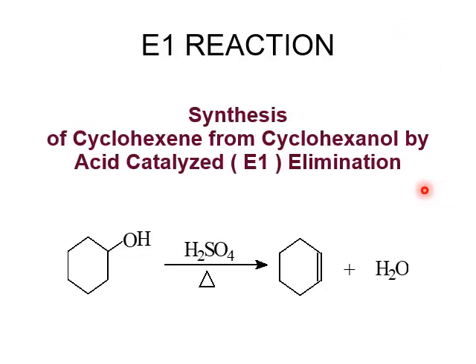So the reaction you're going to do today uses cyclohexanol and sulfuric acid to give cyclohexene and water as products.